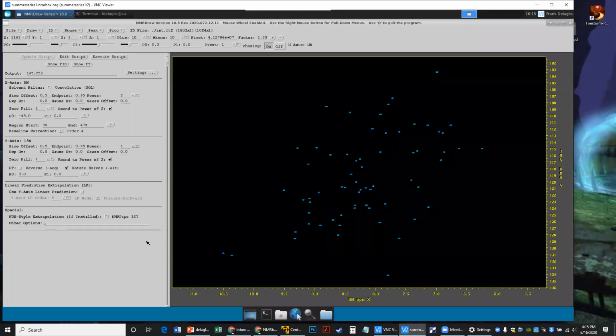The whole situation is kind of strange, Jeff, because these reconstruction methods are used to suppress sampling artifacts, right? Yeah. And then once you do that, we subject them to an ordinary Fourier transform scheme and add a new set of artifacts on top of them.